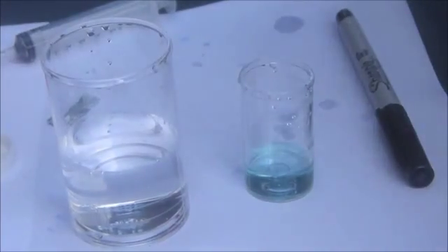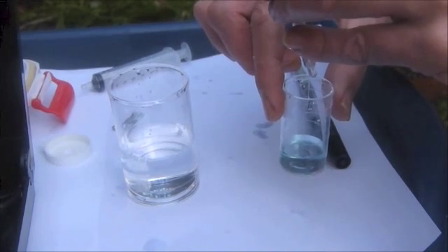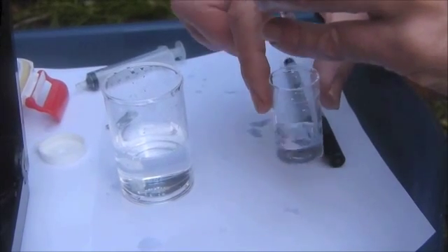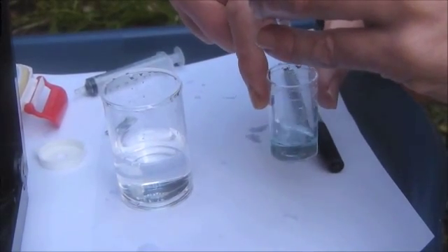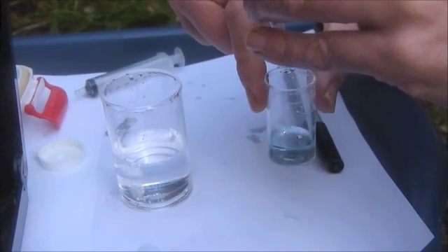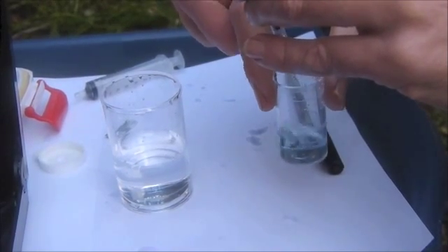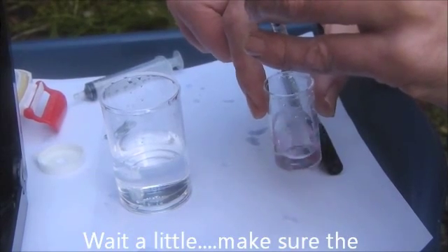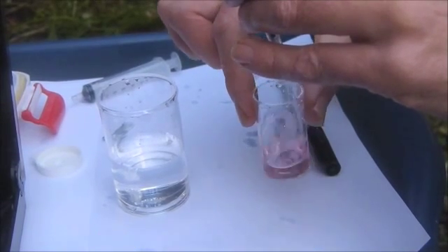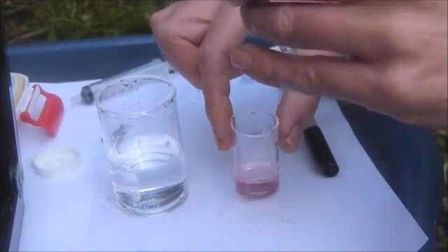We take our syringe with acid, we add the indicator drop by drop, and you can see that it starts to turn red. Sometimes you need to give it a good bit of a shake, because the colour change can go quite slowly. You think it's gone, then it goes back to blue again, or green. But this time I think it's really gone.